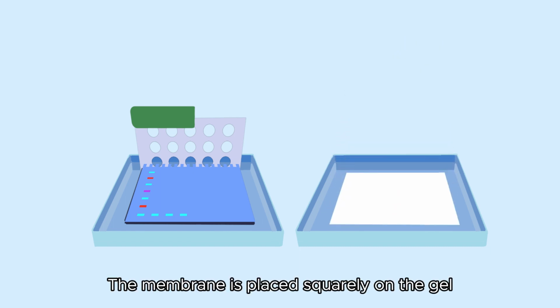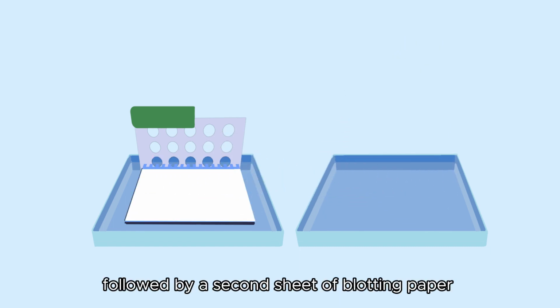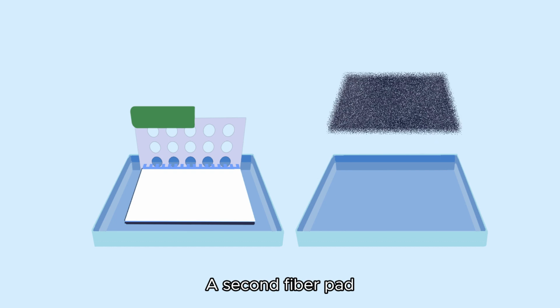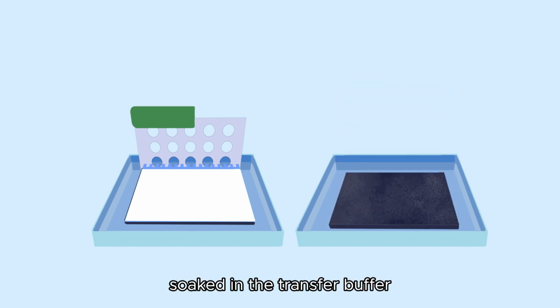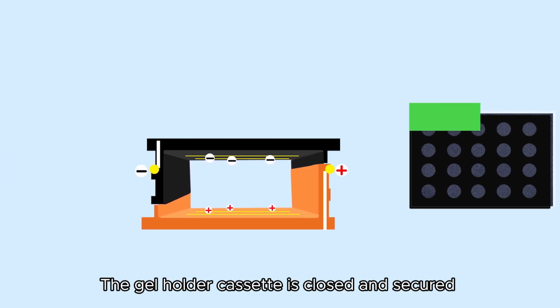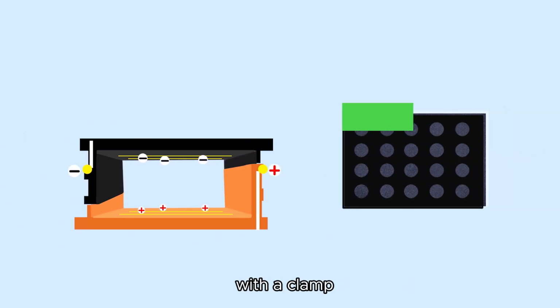For the transfer, a pre-soaked nitrocellulose membrane or polyvinylidene difluoride membrane can be used. The membrane is placed squarely on the gel, followed by a second sheet of blotting paper wetted with the transfer buffer on top of the membrane. A second fiber pad, soaked in the transfer buffer, is then laid on top of the blotting paper. The gel holder cassette is closed and secured with a clamp.